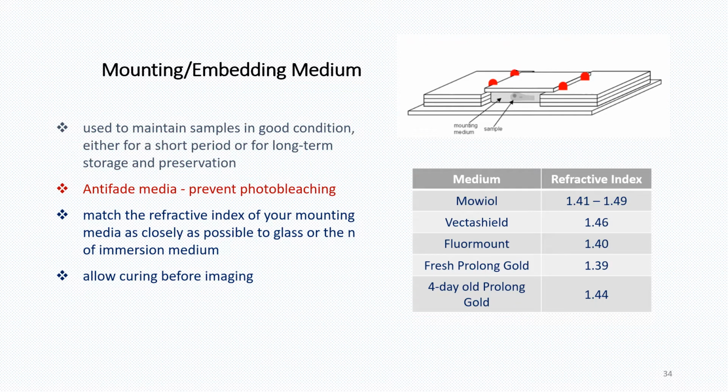Many formulations of mounting media optimize refractive index to match that of glass, although typically these will not reach the specified refractive index values until after they have fully cured. Properties to protect the sample from photobleaching also tend to increase during the curing process.